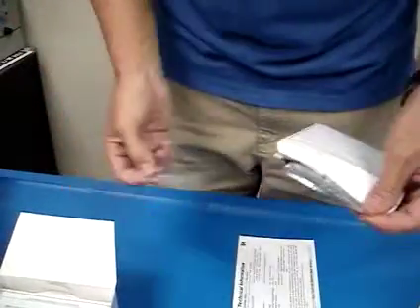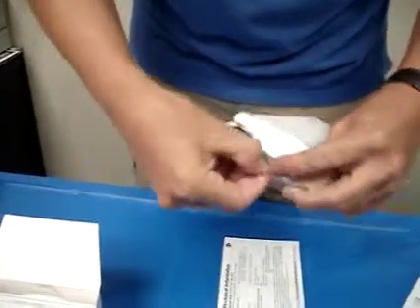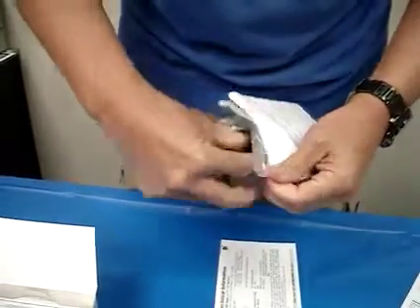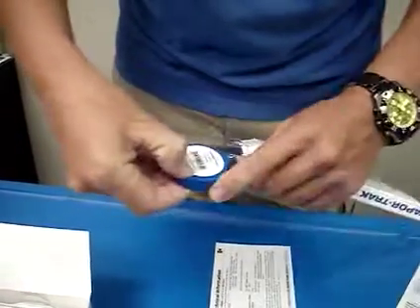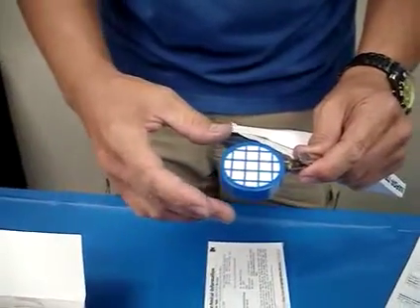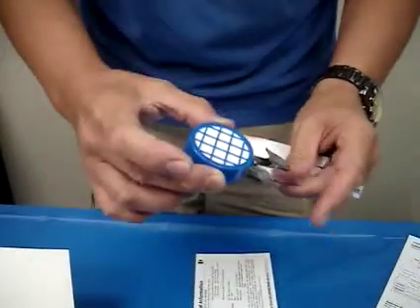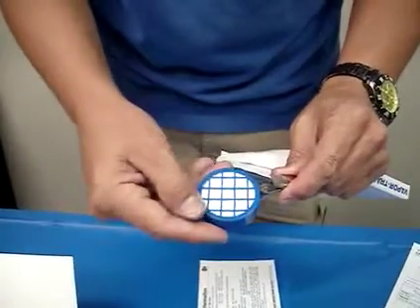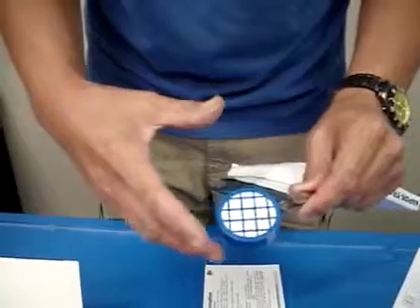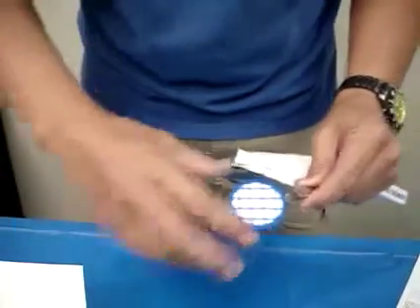We're going to break open the inner foil pouch and remove the badge. Make sure that your hands don't have any residual chemicals on them while you're handling the badge, whether it be when you first take the badges out or put it back in, because any residual chemicals that you might smear on the badge or splash on the badge is obviously going to skew the numbers and it's not going to be accurate.